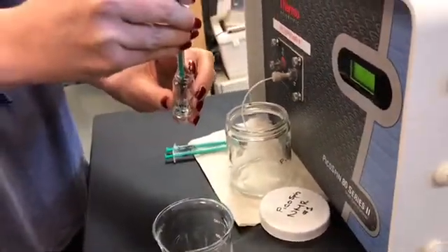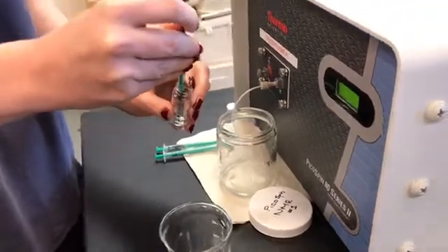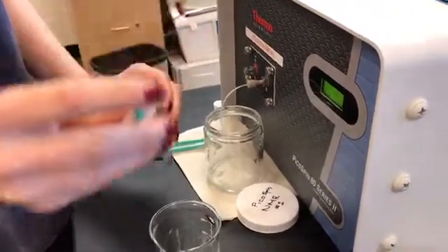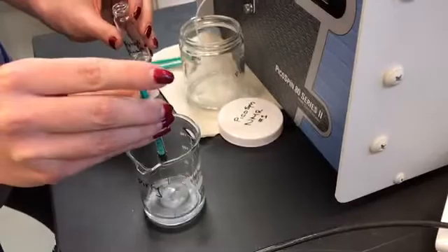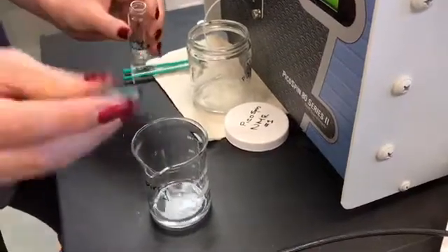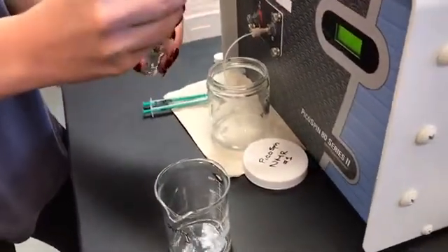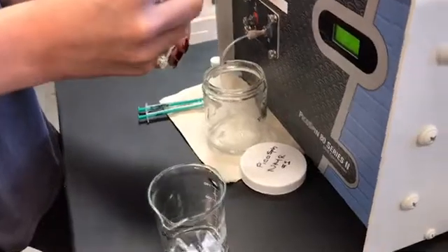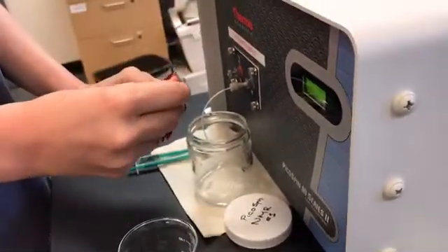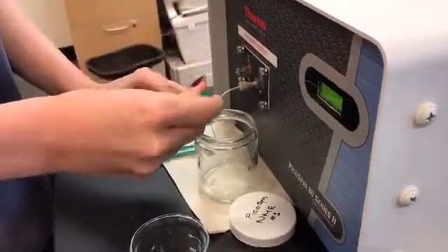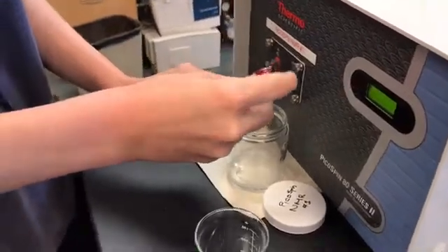Again, take up some sample into the syringe. Once again, just put it in the waste beaker. And then the third time, I'll be actually using this sample for my NMR. So I'll take up about 0.4 milliliters of my sample.